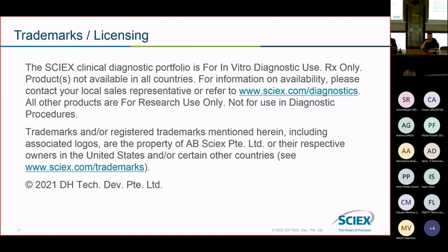You still work with high flow rates, yes? Or with 150 micrometer columns? That means you did not really work with a nanospray column. The system is equipped with a, how can I say, a normal spray column. You saw that the column was 150. So you typically compare with 75 or even narrower columns.